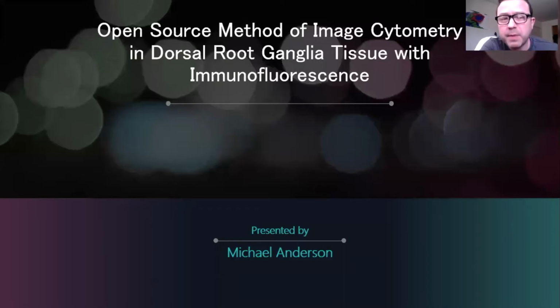Hello, my name is Michael Anderson, and I'm here to present an open source method of image cytometry in dorsal root ganglion tissue with immunofluorescence.